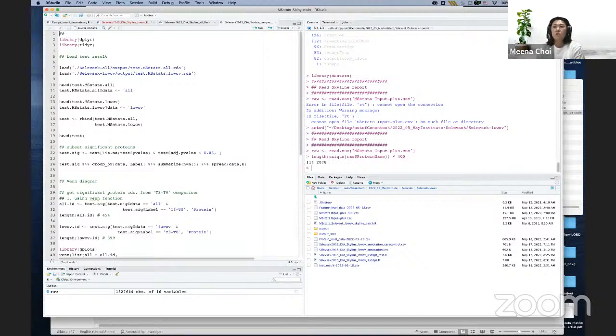When we normalize, multiple steps of processing are important, but we have to be aware that too many processing steps can actually ruin the data. So that's why normalization is a really key part. Sometimes, if our assumption for a normalization is not suitable for your case, you can completely ruin the data. One example is the IP experiment.